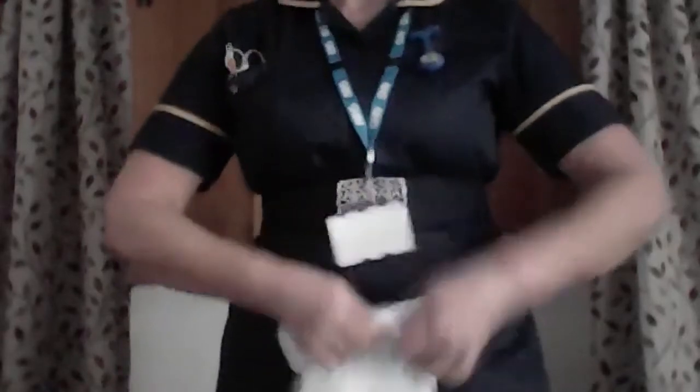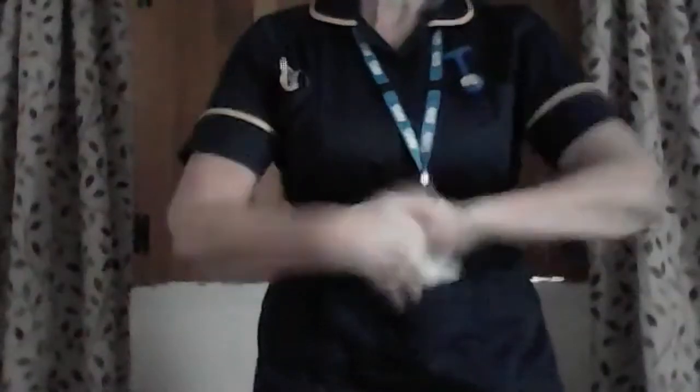Break the apron at the back, drop it down, and then break the apron, fold it round so that you only touch the inside of the apron, roll it up and dispose of it in the bin and sanitize your hands. You're then safe to leave the resident's room.